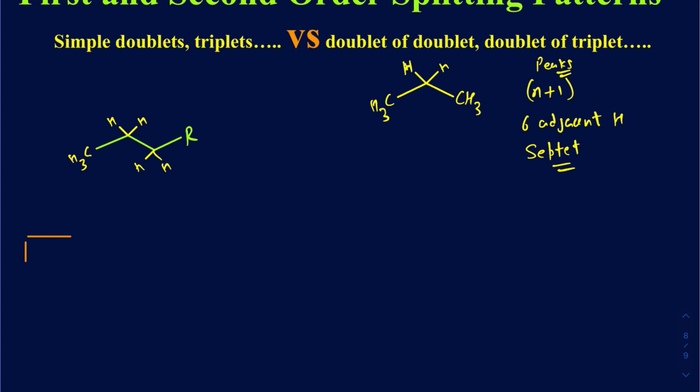What we're really worrying about here is the splitting pattern for these middle two protons.